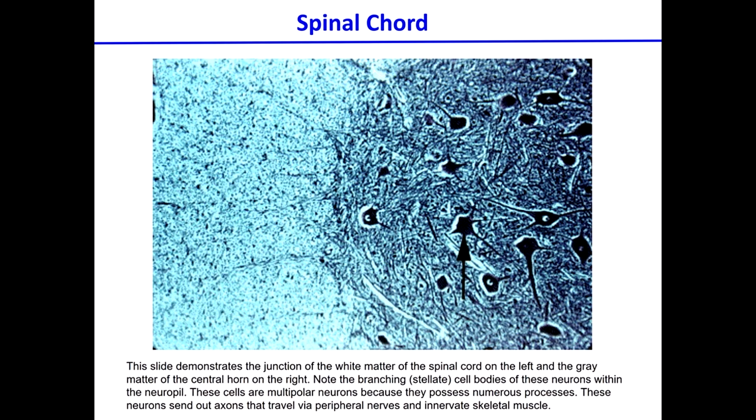This is the spinal cord, and what it's trying to illustrate is a point of connection between the white matter and the gray matter. If you remember, we said the gray matter contains cell bodies, which you can see, plenty of them. Both contain glial cells, and probably this tiny nucleus in there comes from glial cells. The white matter contains primarily nerve fibers, primarily axons, stained in a completely different way, and you see the transition from one to the other. Questions?